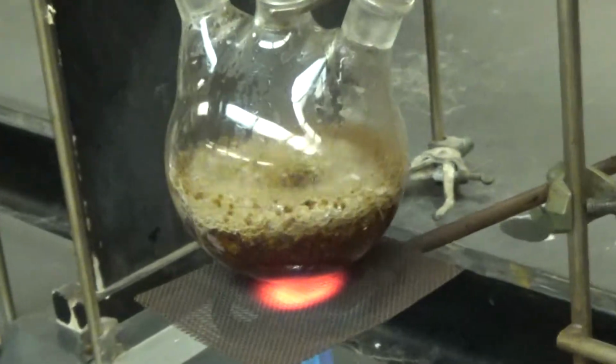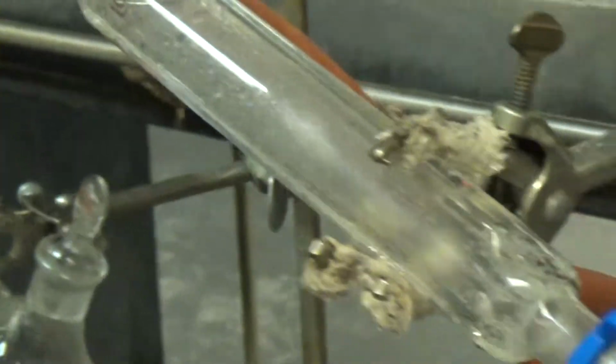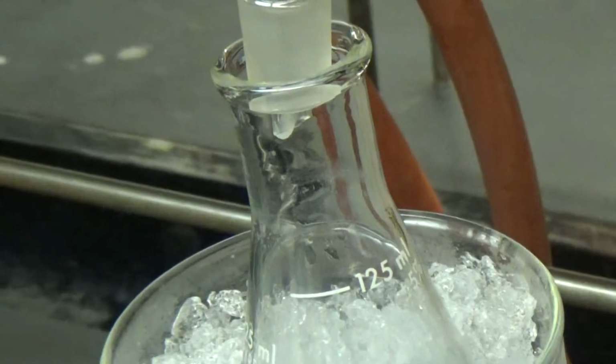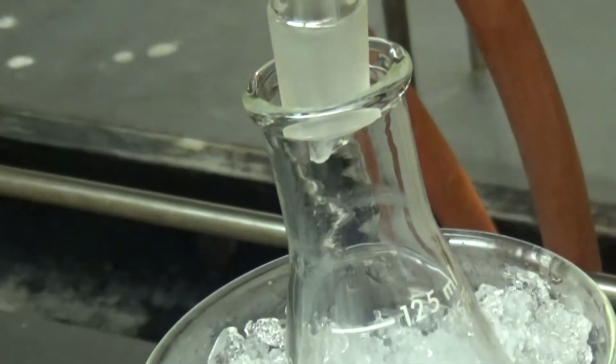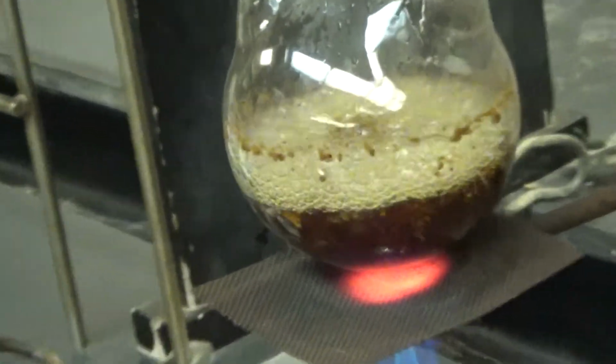Looks pretty cool. I'm going to collect until 75. And what's your temperature? It's coming off at about 100 degrees, which makes sense because water boils at 100 degrees. Yeah, 95-ish. And the clove material, what's the chemical? The eugenol. Eugenol, that's the chemical.